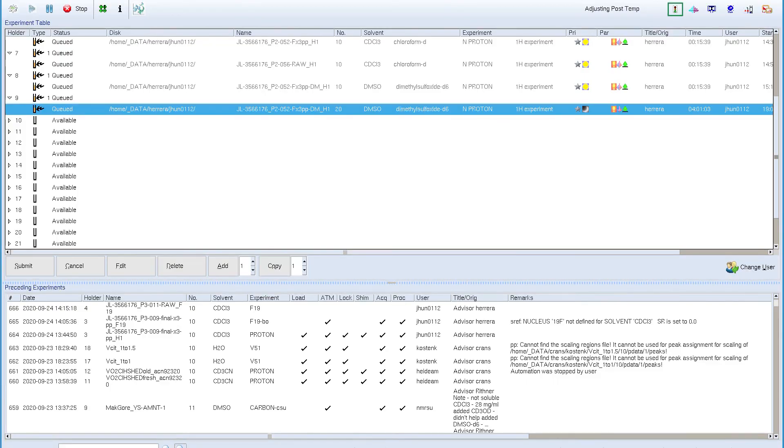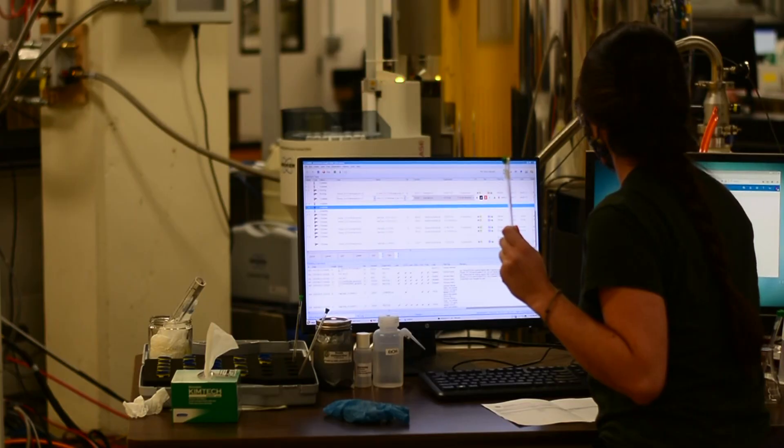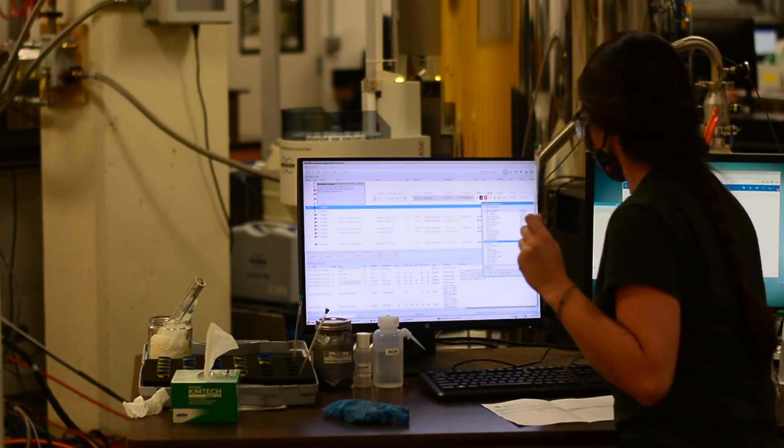You can come in and delete your completed experiment from the experiment window and log out, and your NMR sample acquisition is complete.